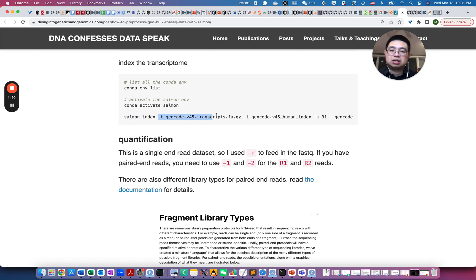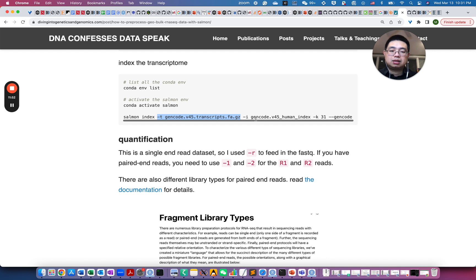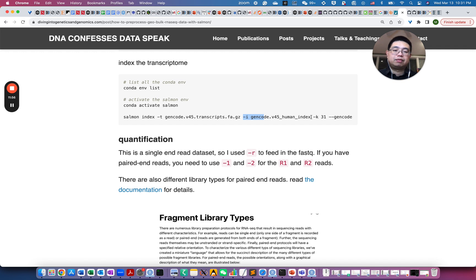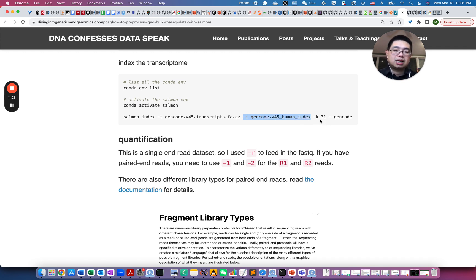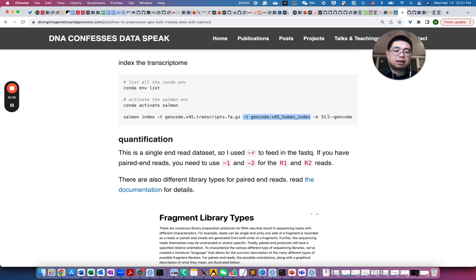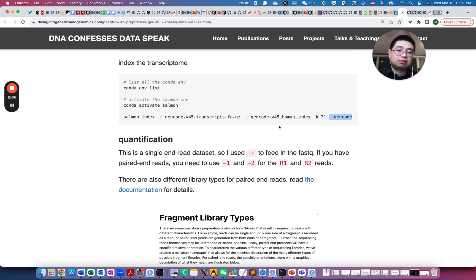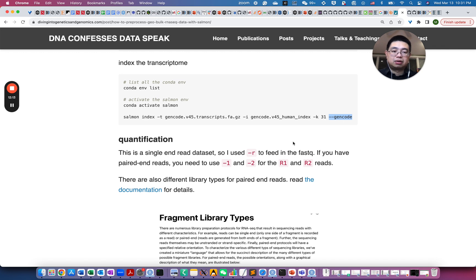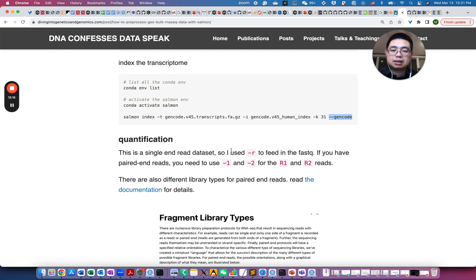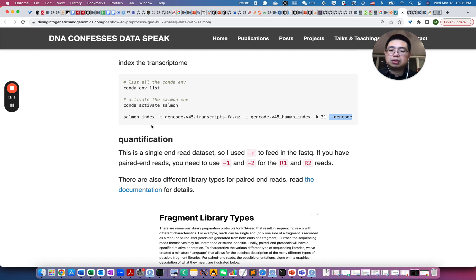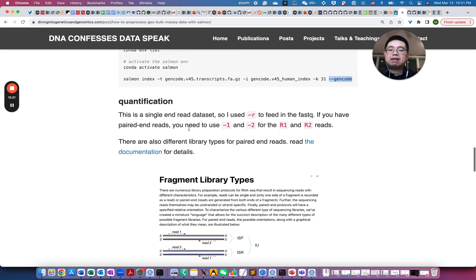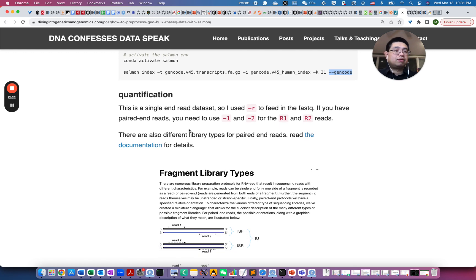So -t is the FASTA file, and -i is the output folder for the Salmon index, and -k is the k-mer. So 31, 31-mers. And then you specify this FASTA file is from Gencode. So you can also omit this if it's not from Gencode. So once it will take maybe 10 minutes or so to build this index. And once you have this knowledge ready for quantification.